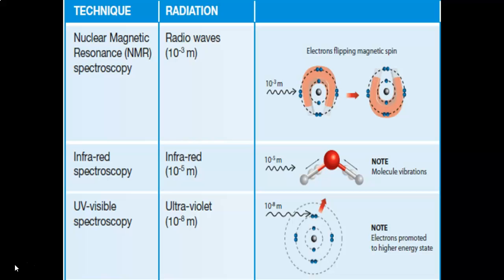It has its electronic motion and electronic energy band. So in UV-Vis, the energy has its levels, where once the electron is in the excited state, the higher energy level, it is in a more unstable position than when it was in its relaxed state, which we call the ground state.